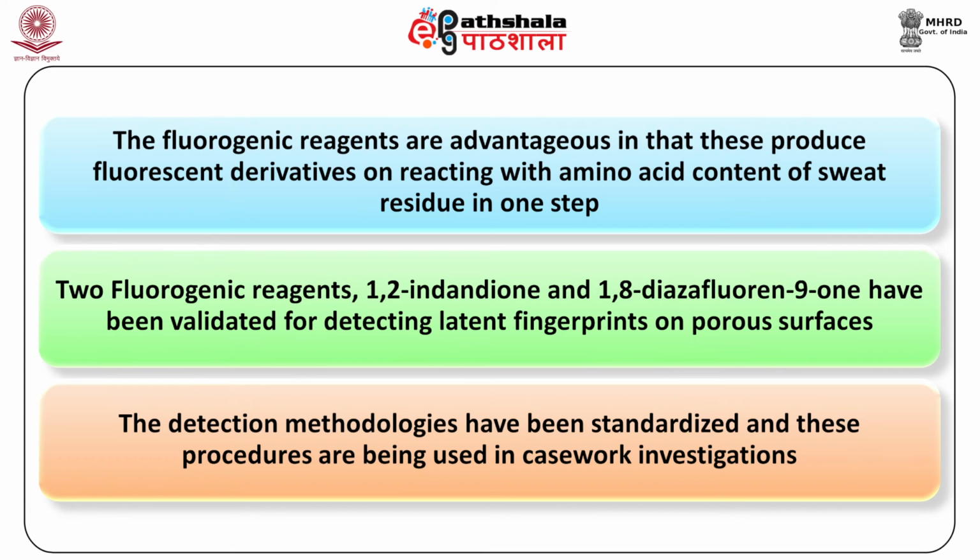And then lastly, we have learned that two fluorogenic reagents, that is 1,2-indandione and 1,8-diazafluorenone, have been validated for detecting latent fingerprints on porous surfaces. The detection methodologies have been standardized, and these procedures are being used in casework investigations.